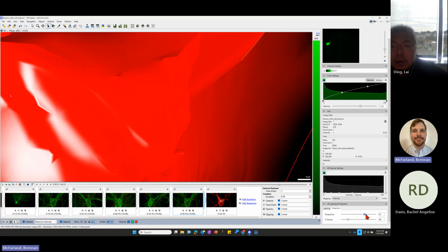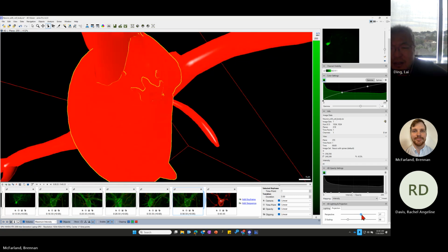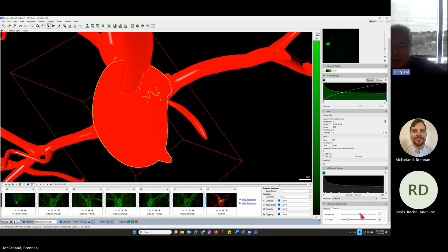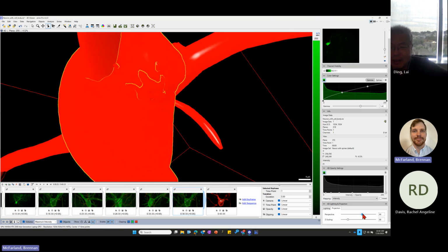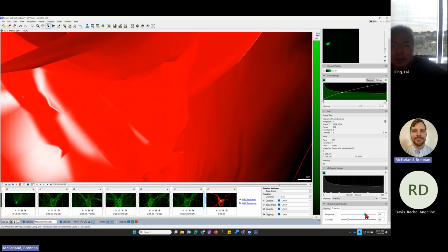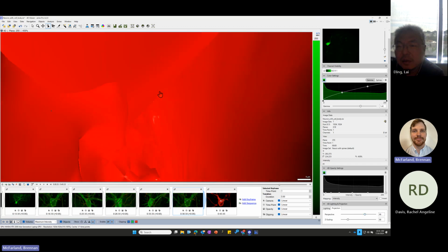What do you mean to make it out? Can you repeat that question, Lai? What do you mean you said to make it out? I have trouble. So I can see right here, we're going into the cell body, and I can see that we're kind of inside of it, but I'm having trouble getting an understanding of where we are inside of it. You know what I mean?